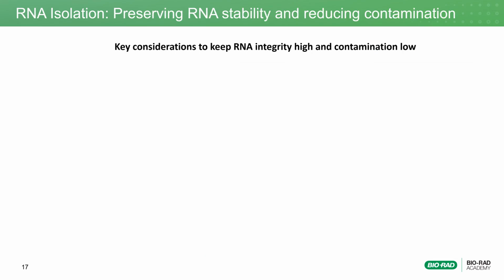In addition to choosing the appropriate RNA extraction kit based on the tissue type and RNA biotype that a scientist is interested in, there are a few precautionary steps that should be performed at the benchtop to ensure a low probability of RNA degradation while preserving the purity of your sample. Let's review a few of these steps below.